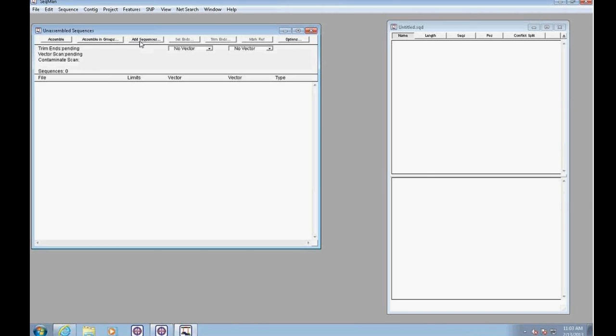It has shortcut commands for adding your data, as well as changing some options for trimming and marking reference sequences as reference. On the top, we have the file menu and additional options for advanced features I'll walk you through in the software.